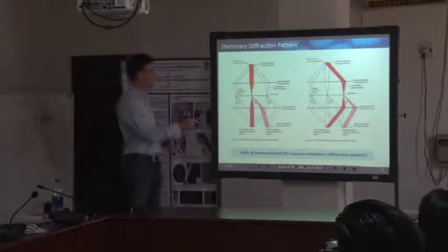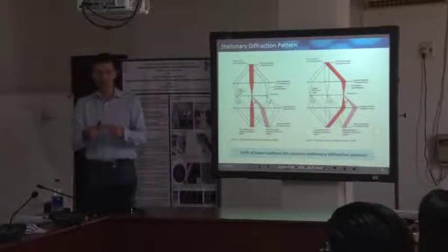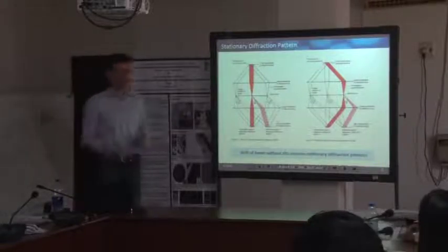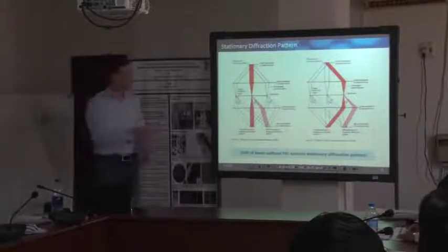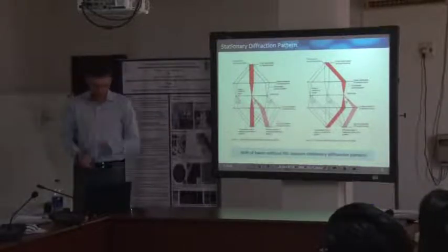And this holds for every measuring point. I would say for scan fields below 1 by 1 micron. So for very large scan fields, this is not realized that perfectly anymore. But in principle, we want to have a perpendicular beam in all measuring points in our sample.